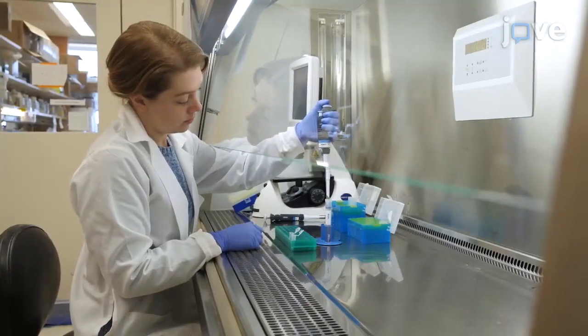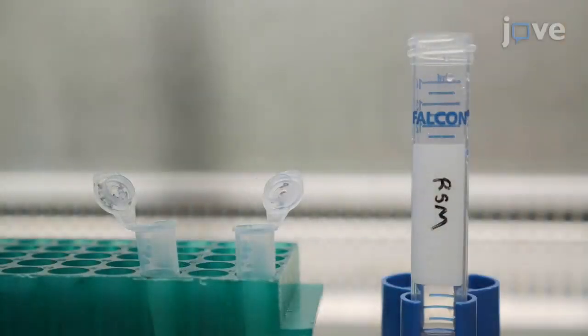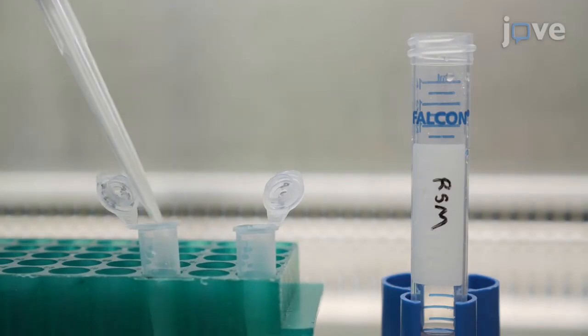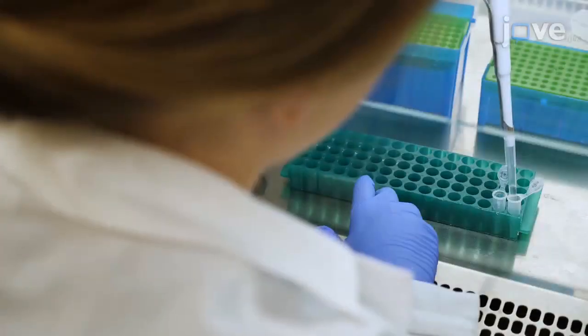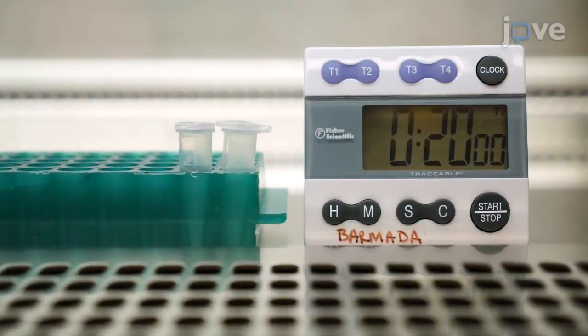To begin, combine the appropriate amount of reduced serum media and transfection reagent in one tube, and reduced serum media and DNA in a separate tube. Incubate them at room temperature for 5 minutes. Then, combine the contents of both tubes and incubate at room temperature for 20 minutes.